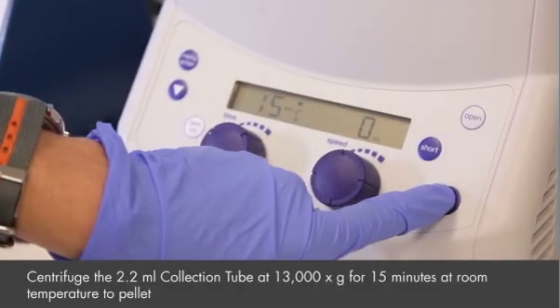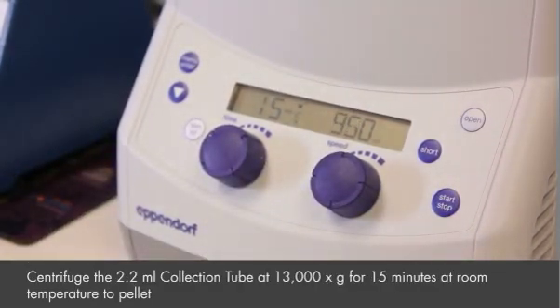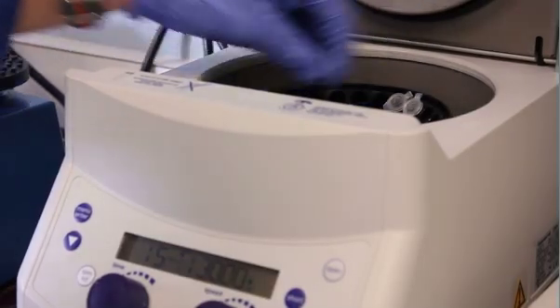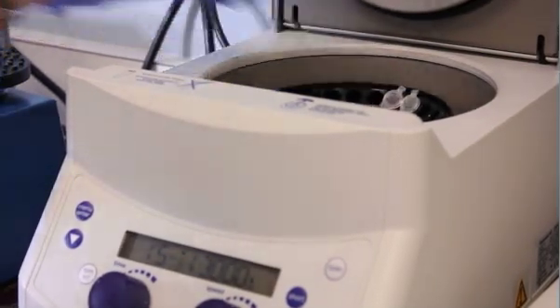Centrifuge the 2 ml collection tube at 13,000 times G for 15 minutes at room temperature to pellet. Position the tubes to have a reference point for the location of the pellet that may not be visible.